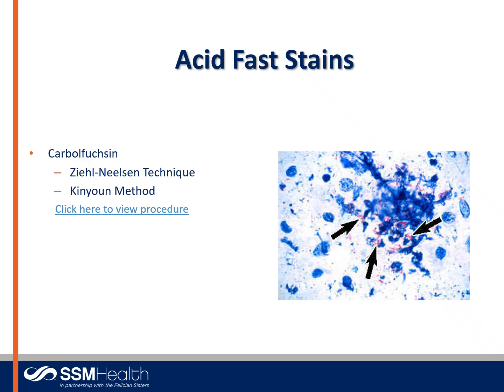We're going to discuss some other stains that are used in the microbiology lab to stain other types of bacteria. Acid-fast stains are used to stain acid-fast bacilli. Those are bacteria whose cell walls possess thick, waxy cell walls. They contain a large amount of mycolic acid. Once these organisms are stained, the bacteria are resistant to typical decolorization, even by acid alcohol and acetone. So now they're called acid-fast because they are resistant to the acid in the decolorization process.